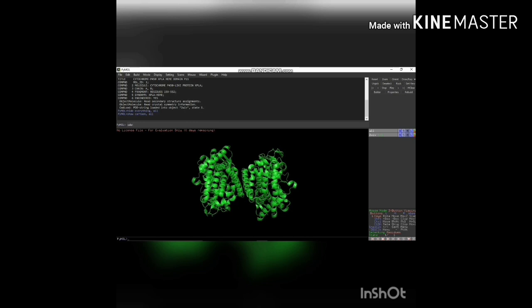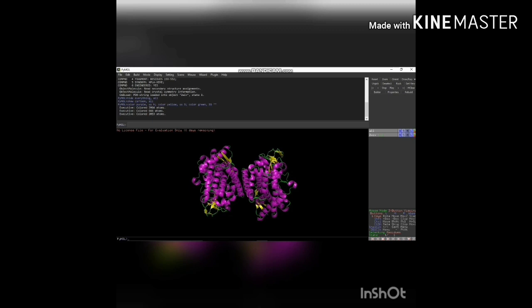Give the command: color purple, ss h — where 'h' refers to helix. Then: color yellow, ss S — where capital 'S' refers to sheets. And: color green, ss 'L' — where 'L' refers to loops. It will show the respective colors you have given: purple highlighted for helix, yellow highlighted for sheets, and green highlighted for loops.